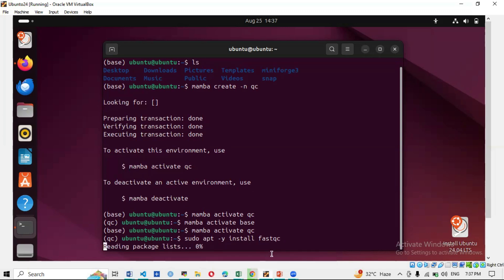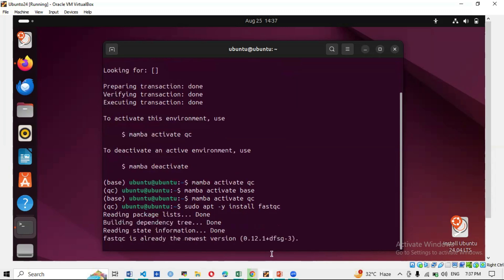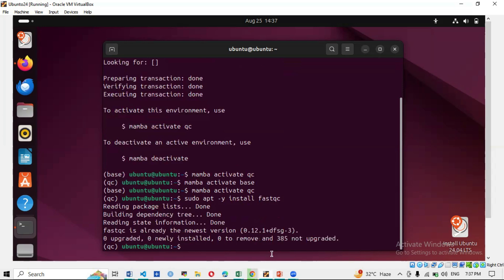Press Enter and the installation will start, reading the command and installing FastQC. Since I already have it installed, the terminal tells me it's already at the newest version. But now you have FastQC installed and can perform data analysis using it.